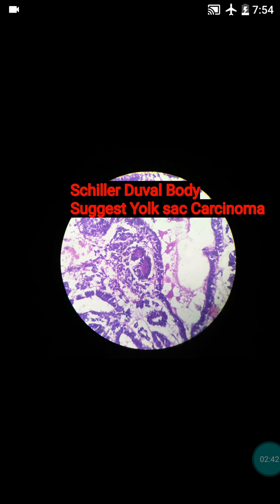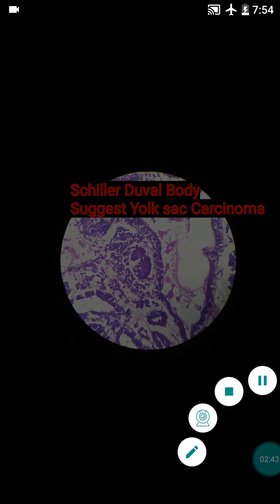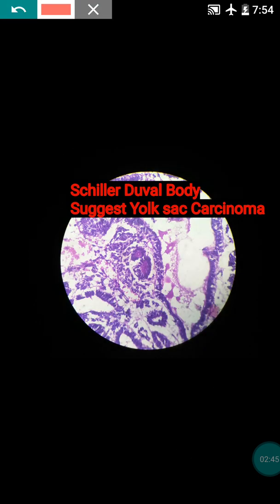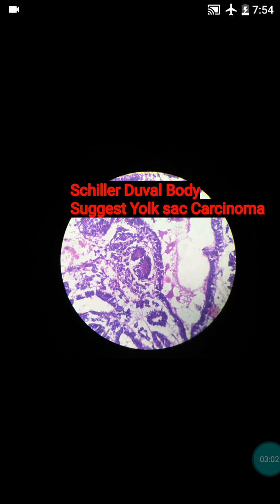During our analysis we also found Schiller-Duval bodies, which are suggestive of yolk sac carcinoma. These are the perivascular arrangement of cuboidal malignant cells around a central vessel — this is the Schiller-Duval body.